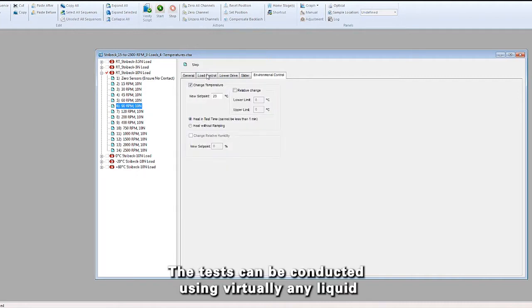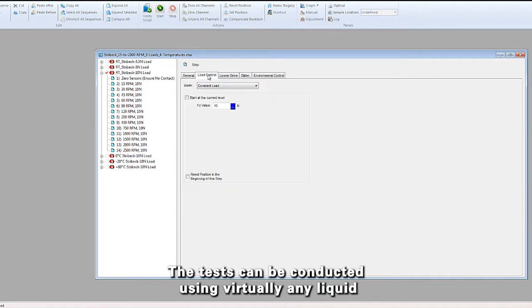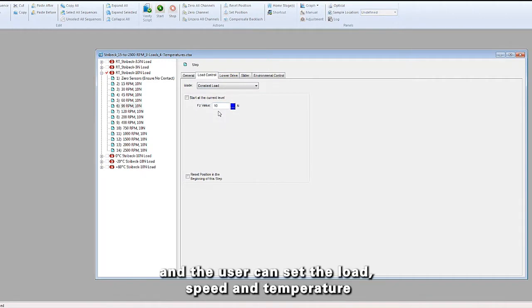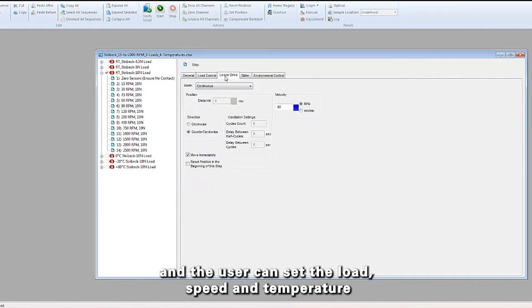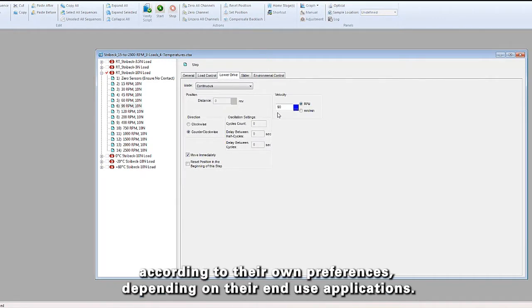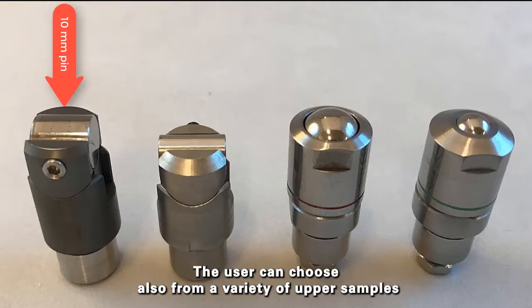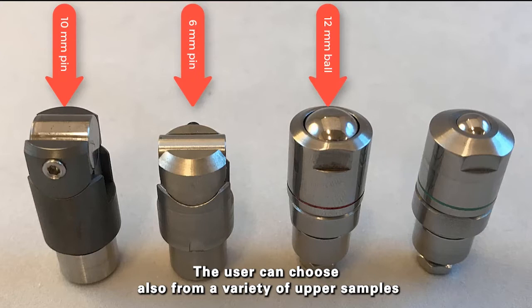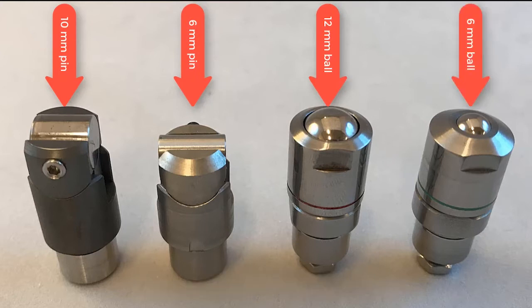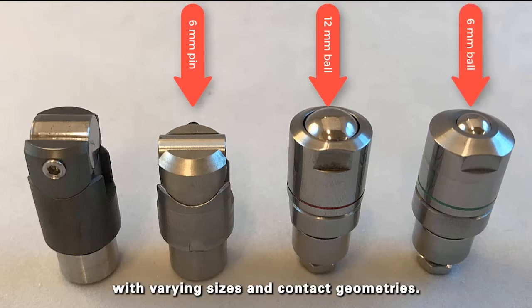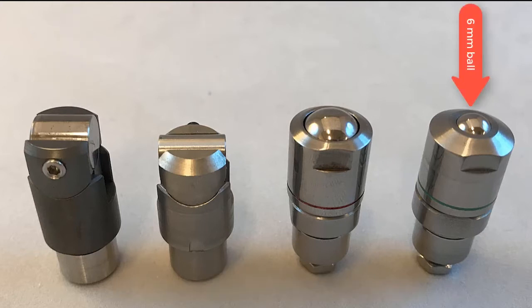The test can be conducted using virtually any liquid and the user can set the load, speed, and temperature according to their own preferences, depending on their end-use applications. The user can also choose from a variety of upper samples with varying sizes and contact geometries.